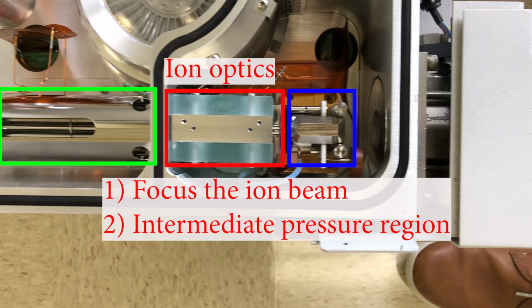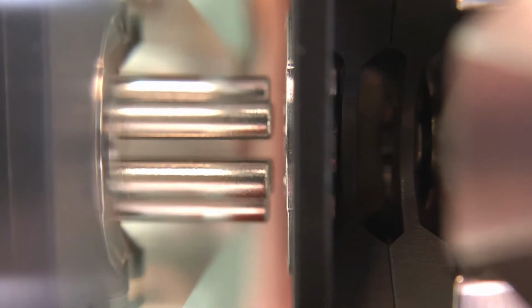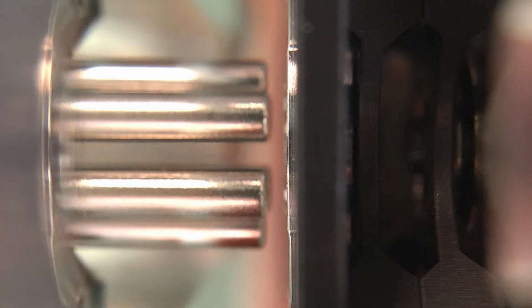So this guy has this EI source. The ion optic here is actually an ion guide called an octopole ion guide. So let's take a look at that specific ion guide right here. If we zoom in on this gap, that is the gap between the ion source and the first ion optic, an octopole ion guide. And you can see it's a series of rods. It's 8 rods, 8 poles, hence the term octopole. So the ions fly out of the ion source through that bit of open space and into that octopole.